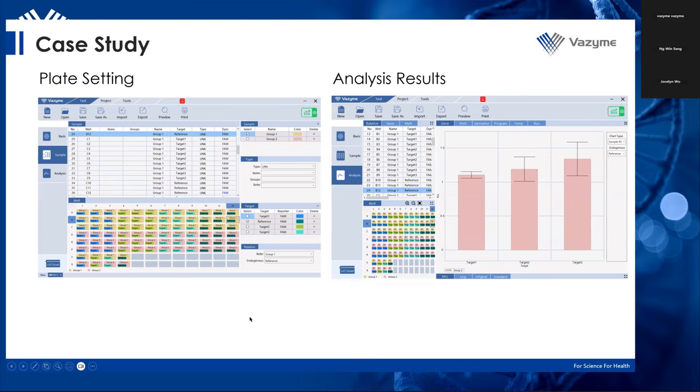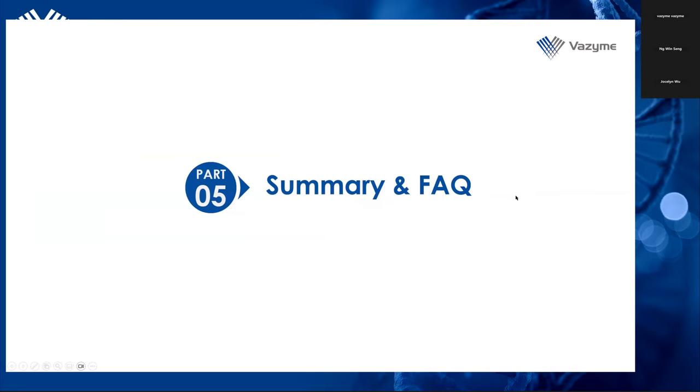This one can run 96 wells. 96 wells doesn't mean 96 samples, because you have to do all the replicates. And then you can also do your result analysis natively on the software. You can do it on the machine or on your own laptop.